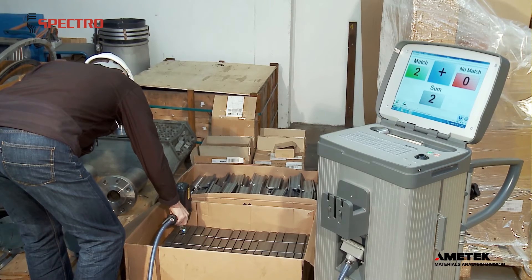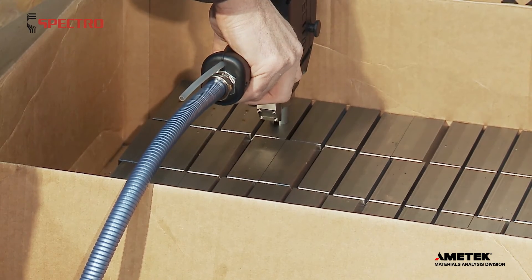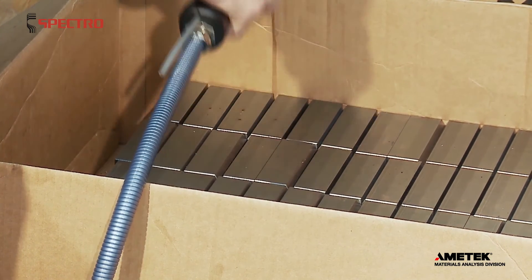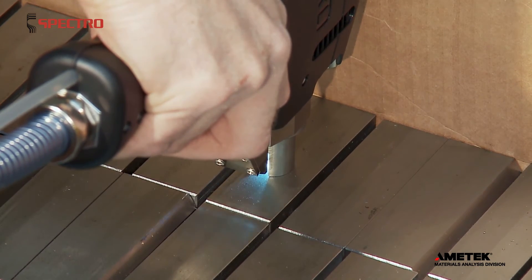The operator tests each piece in the lot in turn. SpectroTest compares each sample to the stored values of the reference piece. Note that each completed piece bears a small burn mark from the arc process.